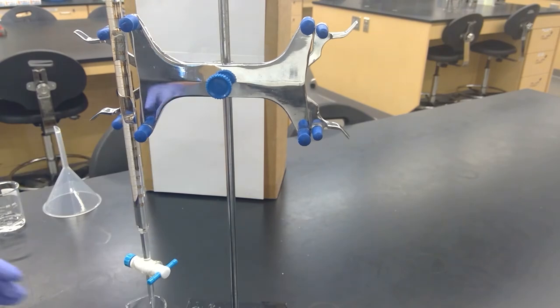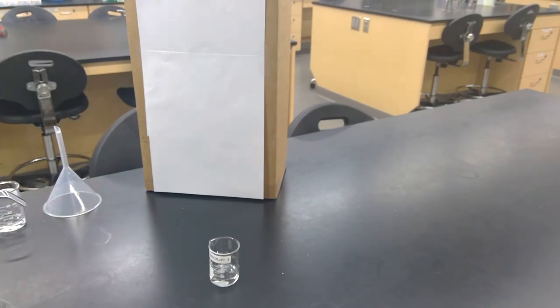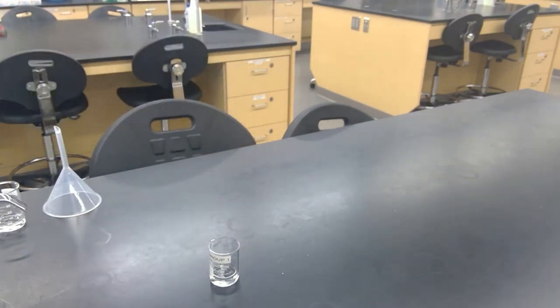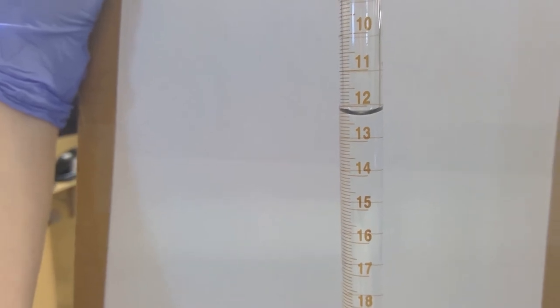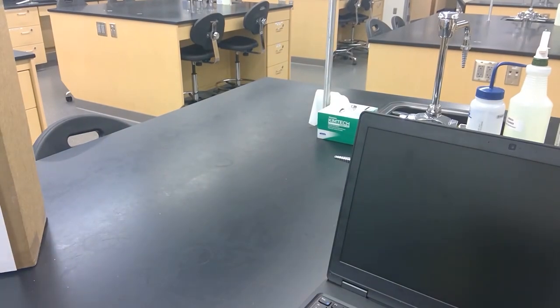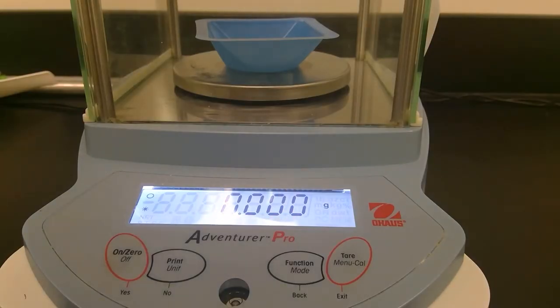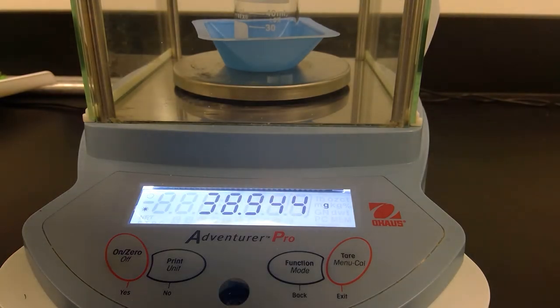Now you'll record the final volume on your burette, and now we will go and measure the mass of the beaker with the water in it again. Close the lid and record the volume, or the mass, of your beaker with the water in it.